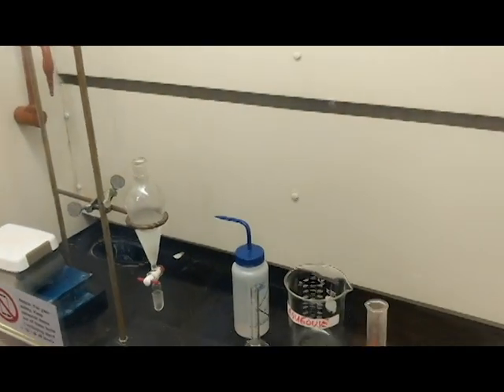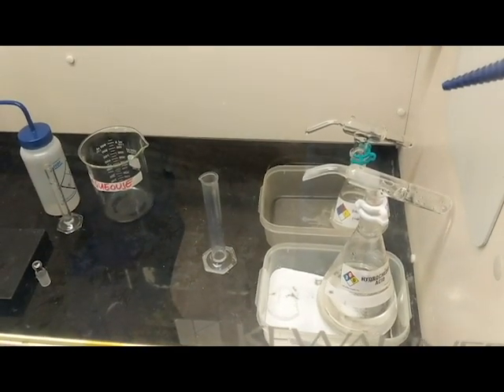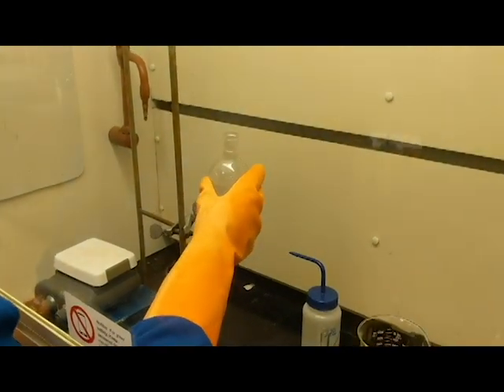At the end, I should neutralize my graduated cylinder with a 5% solution of sodium bicarbonate before I attempt to wash it. That'll make sure that all of the acid is neutralized on the inside.